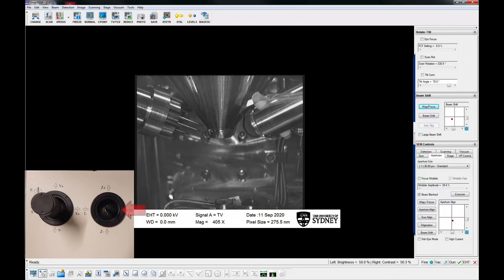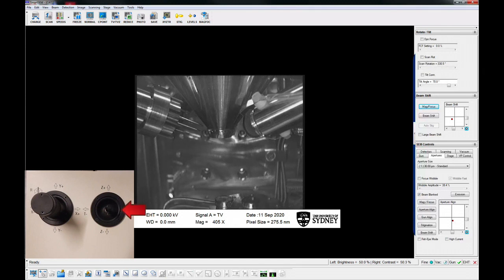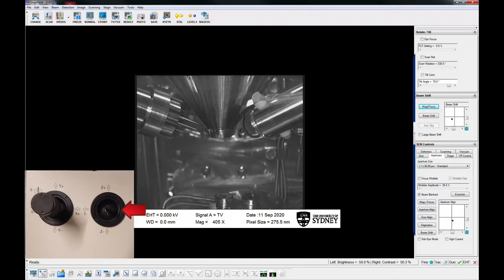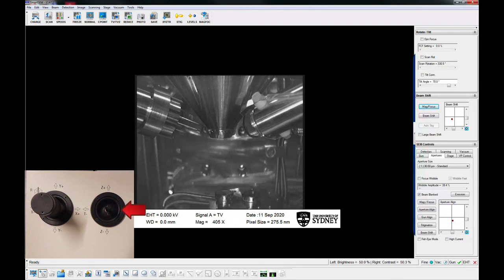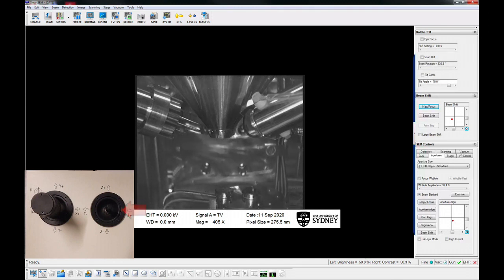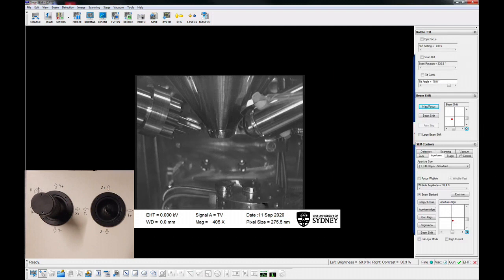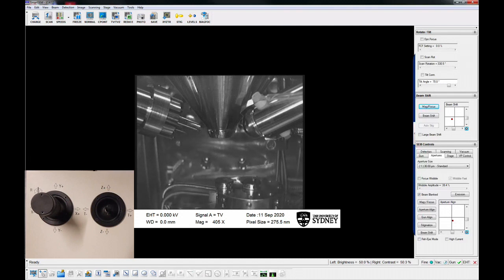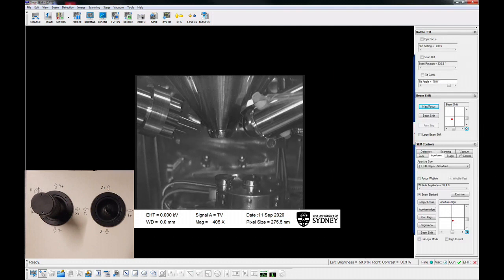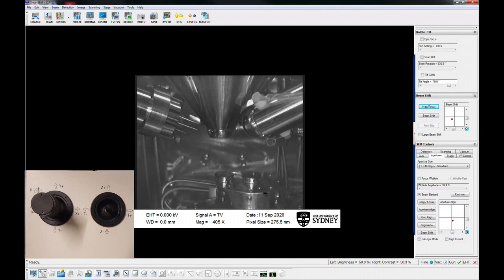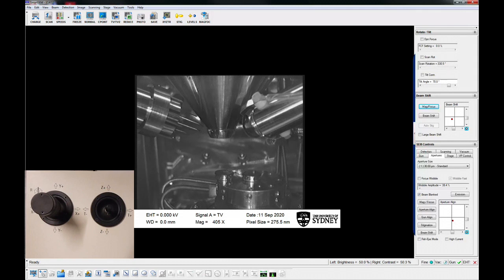Move the stage up using the small joystick so that the specimen is about halfway up the screen. Position the stage so that one of the circumference positions is in the beam path. Always view the chamber scope when moving the sample.